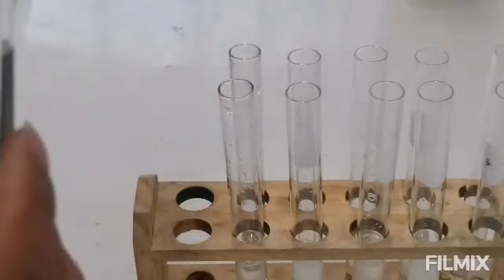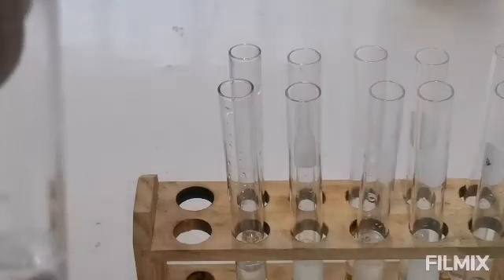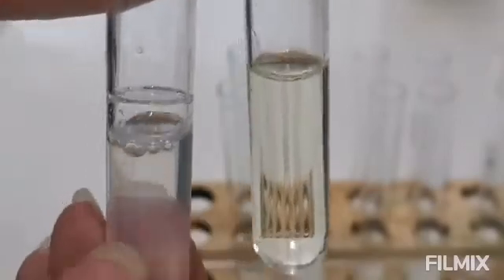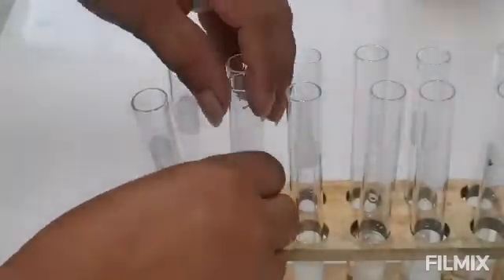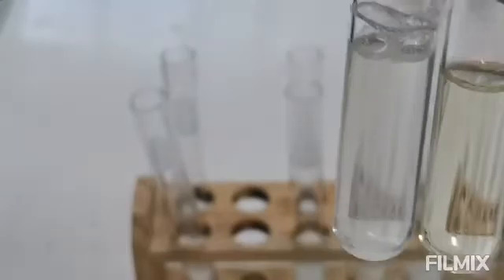I repeat, this is for your beef extract. This is for your egg albumin after adding sodium hydroxide. Can you note the possible difference between the two? Okay, this one is for the egg albumin. This is for the beef extract after adding sodium carbonate. So you can take note of the possible changes.